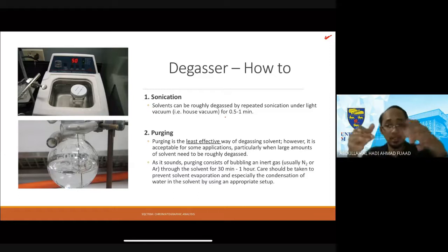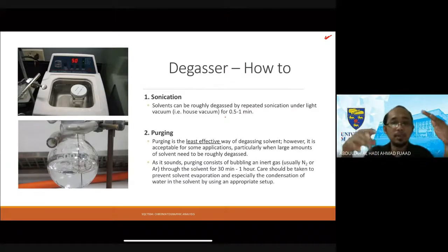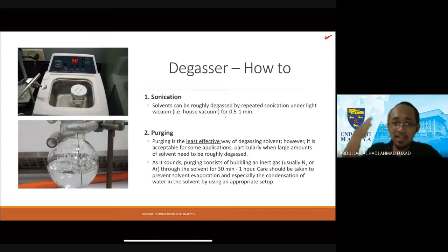So in my case, I previously degassed a 1 liter bottle, 1 liter Scotch bottle, about that size. You can see me, okay? And we did it based on our SOP. We normally do it for about 15 minutes. Okay, 15 minutes at the highest sonication power to actually degas everything before we actually use it. But once we had the degassed system, we normally don't do it anymore.